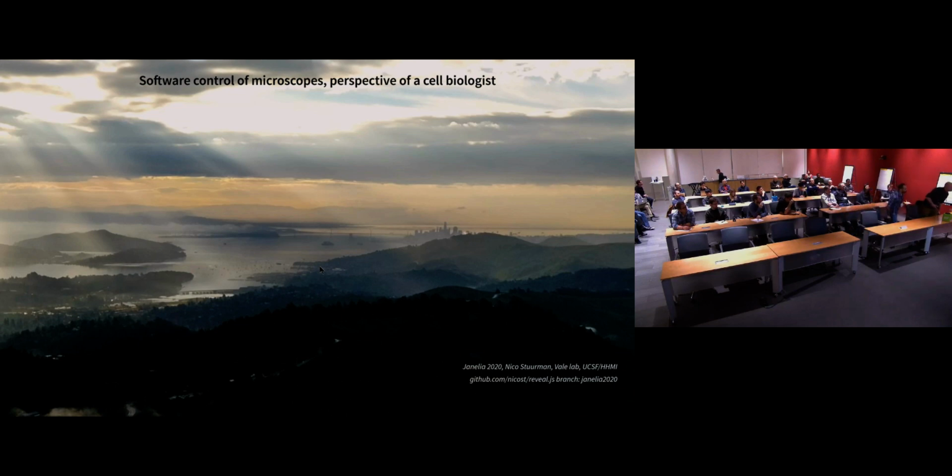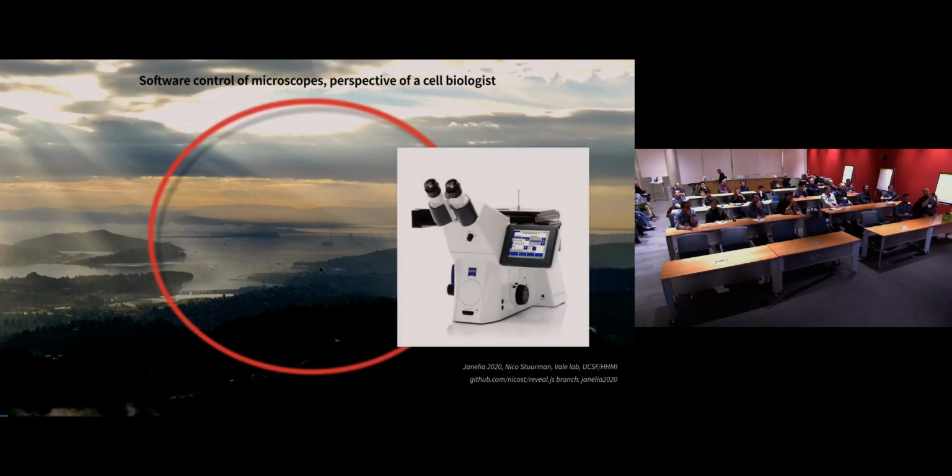In my mind, microscopy for a long time has been a very interesting field in the sense that we have scientist users who want to use the microscopes, and most often they will work with some kind of commercial microscope system that has been packaged nicely by a company, so that a cell biologist or a biologist can easily work with it and get the kind of data out of that they would like.